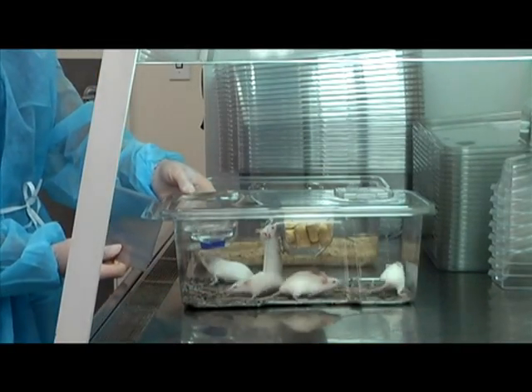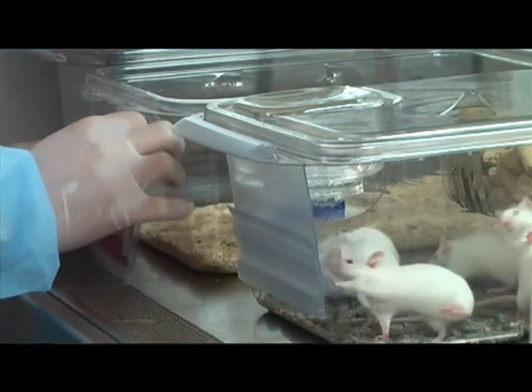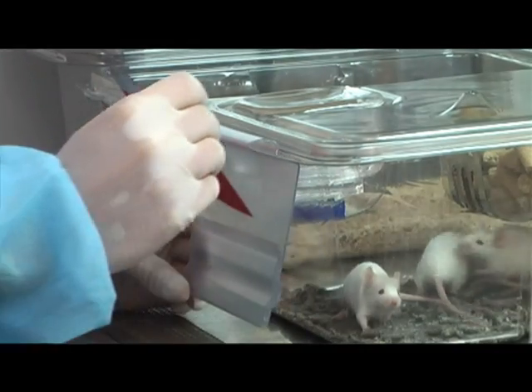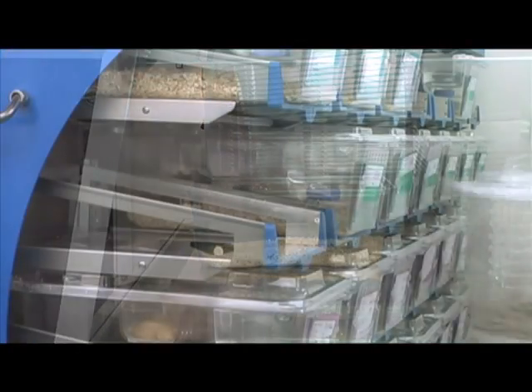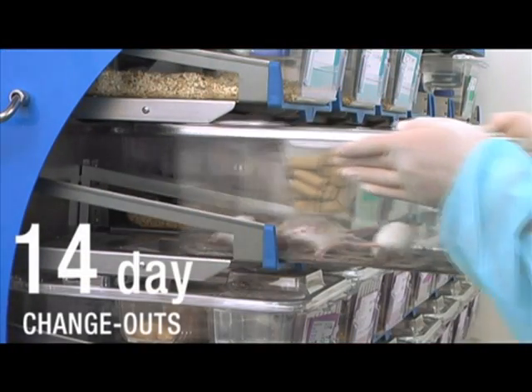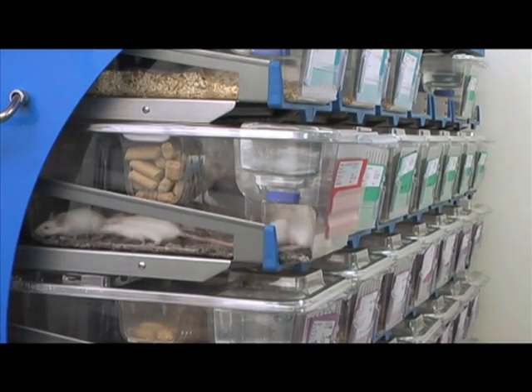Slide the card holders onto the rail on the front of the inner cage and transfer your index card. Your cage change is now complete. Place the inner cage into the inner rack — you will feel a positive docking indication confirming that the cage is in place.